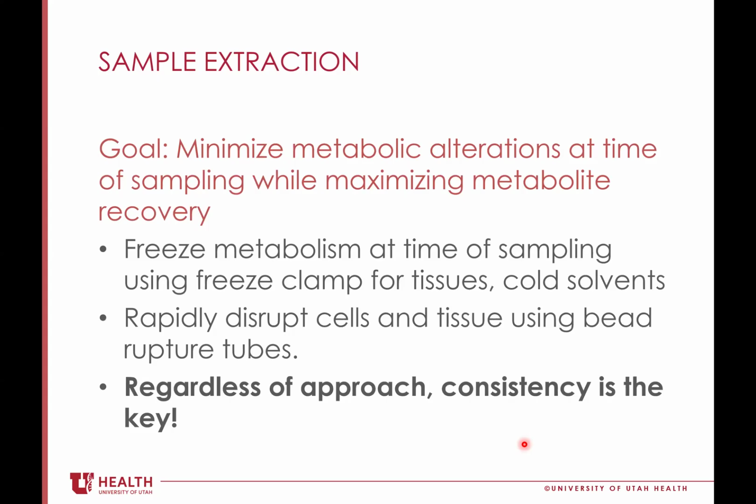really cold solvents. And then with tissue, you're rapidly disrupting cells and tissue using bead rupture tubes, right? But by far, regardless of any approach you're doing here, and please contact us in the core, we've done every extraction possible known to man, consistency is the key, right? So if you're going to do it one way, always keep on doing it that same way every time you do it.